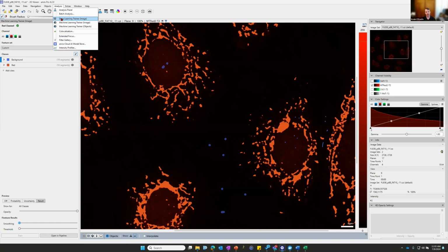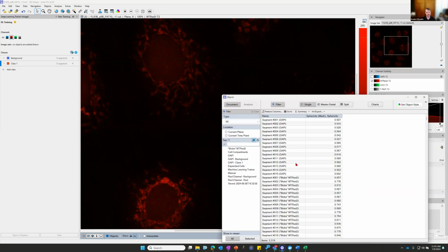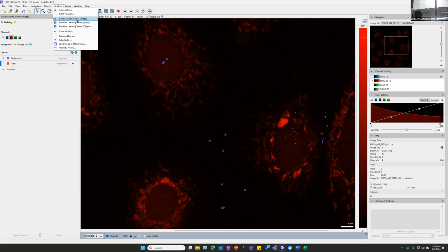But then if, for example, machine learning doesn't work, we can then do this here. And then let's say, I think we should be able to also add these in together. So let's say I want to now take all of my annotations from that machine learning trainer, say it didn't work. Again, I'll have to check. I don't know. Lai, do you know if you guys have the deep learning trainer local? If not, I can look it up myself. I think we have. Okay.